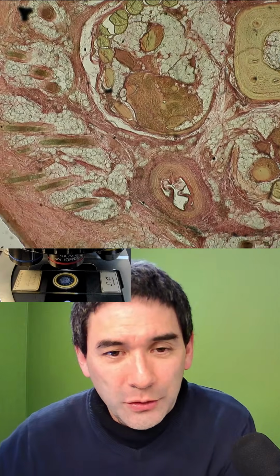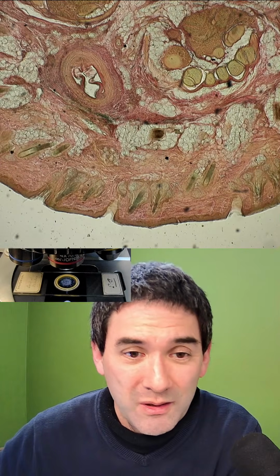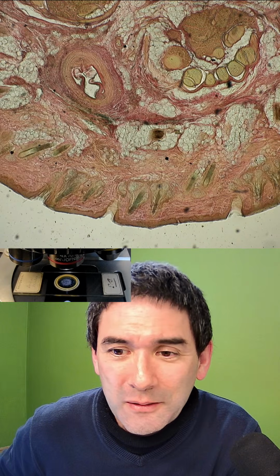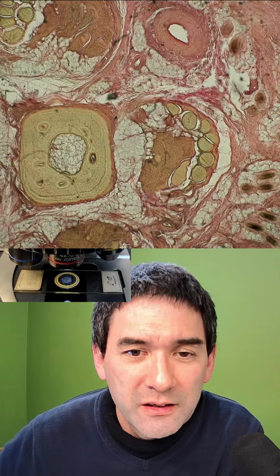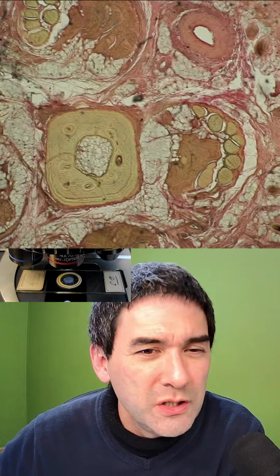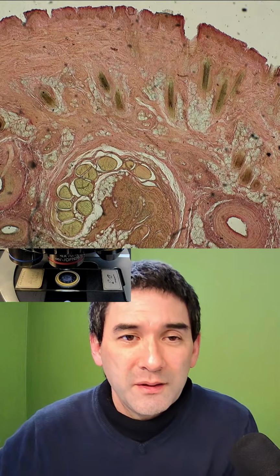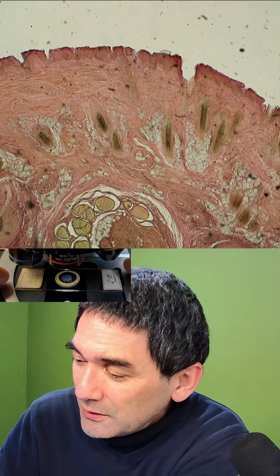So I kind of like this a lot as a histological slide, and honestly, it has survived the test of time. It's still of excellent quality. It was actually a fairly expensive slide. I think I paid around 30 euros or so for this one slide. But from an anatomical and educational perspective, it's really great. So let's put this away.